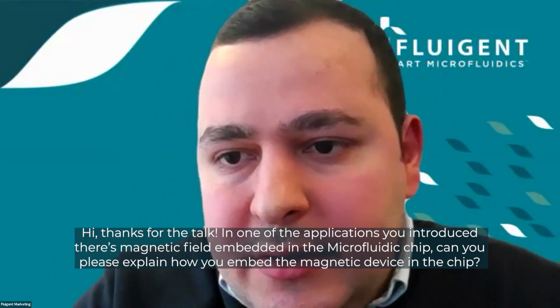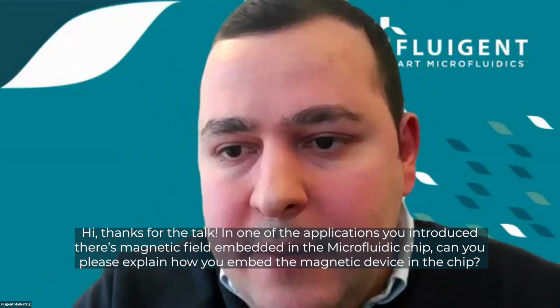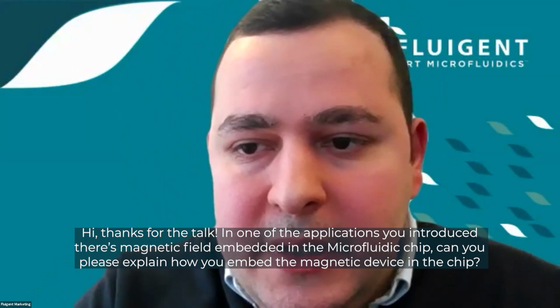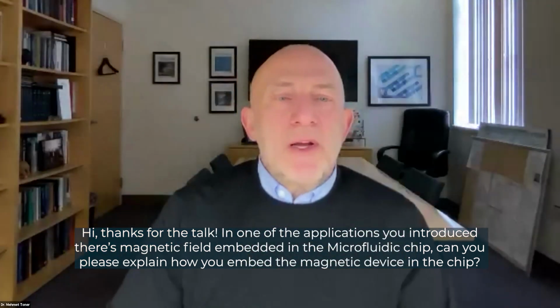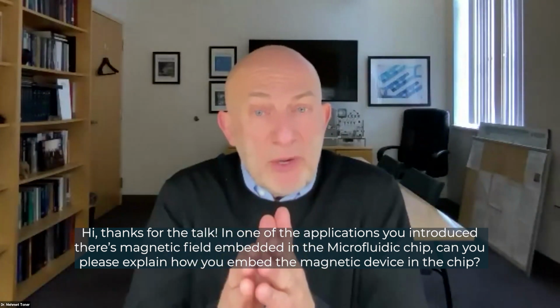In one of the applications, you introduced the magnetic fields embedded in the microfluidic chip. Can you please explain how you embed the magnetic devices in the chip? Yeah, it's actually very easy. The magnets are outside the chip, so we clamp the chip into the 4 magnets.